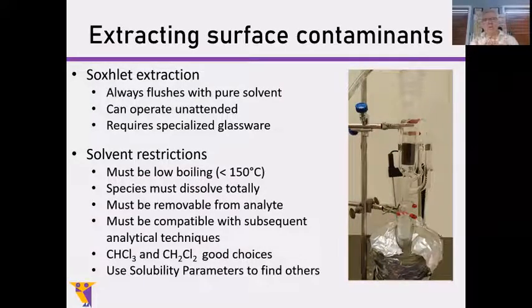And while the technique itself, in theory, sounds very good and very simple, there are some restrictions with respect to polyaromatic hydrocarbons. First, you have to have a solvent which dissolves them. And this kind of limits you from things which might be more benign chemically, at least to humans.